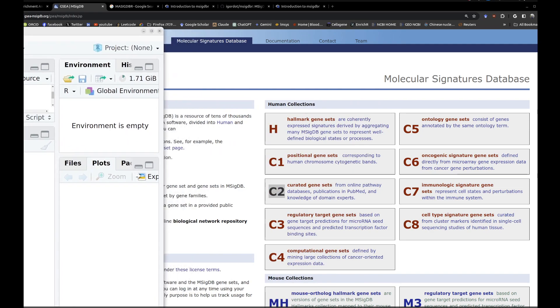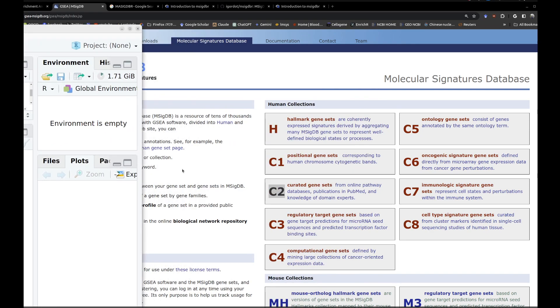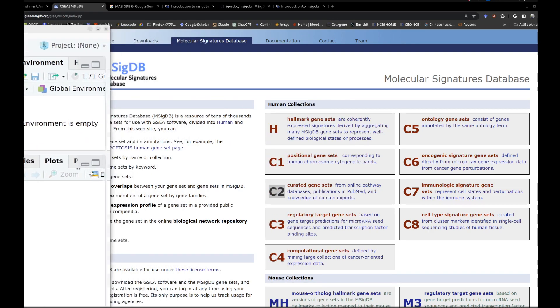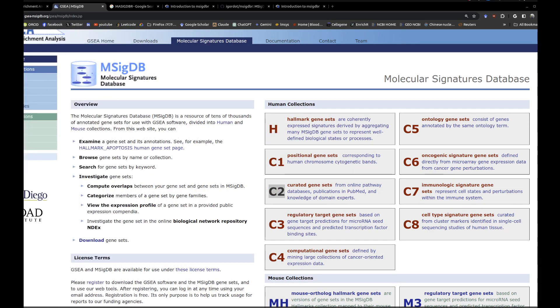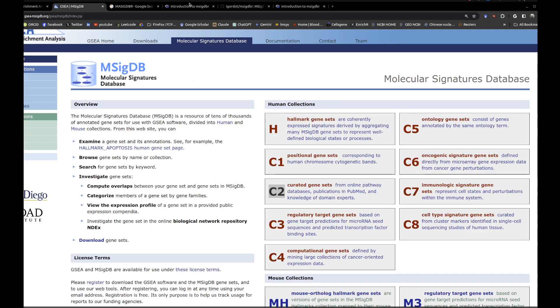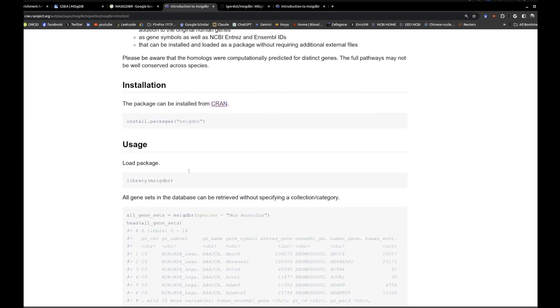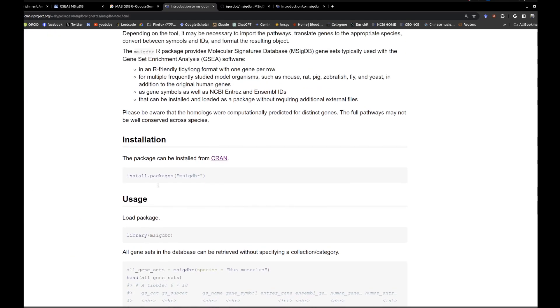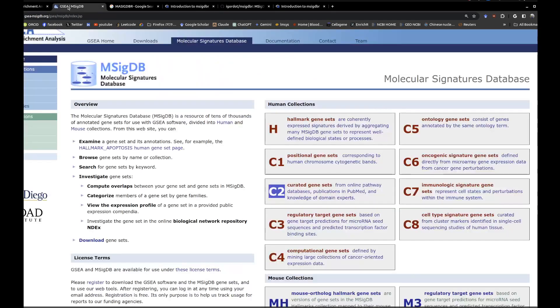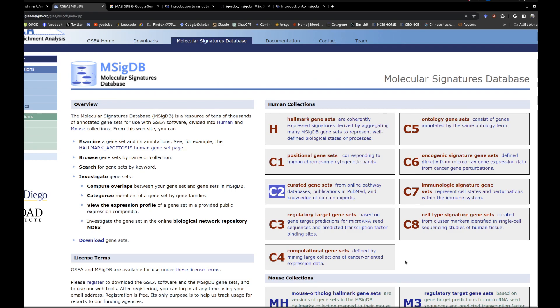And it will give you all those analyses that you need for your own datasets. So let me put it this way: first, you install msigdbr by using install.packages in R Studio, then you import it. After that, you get your differentially expressed gene list.